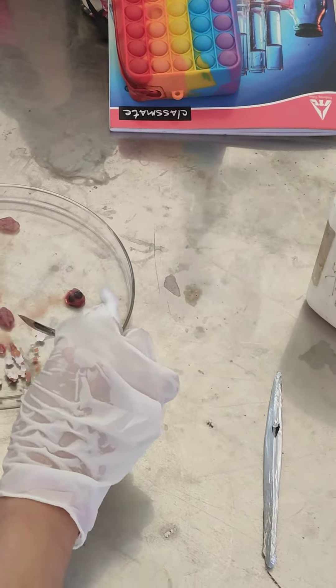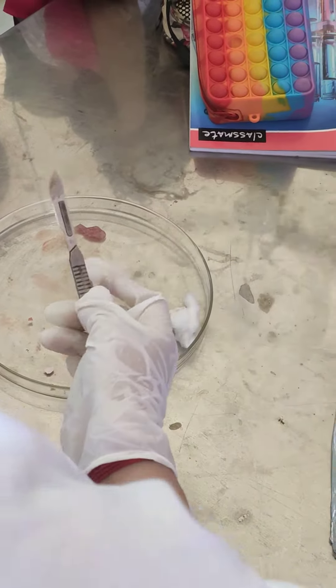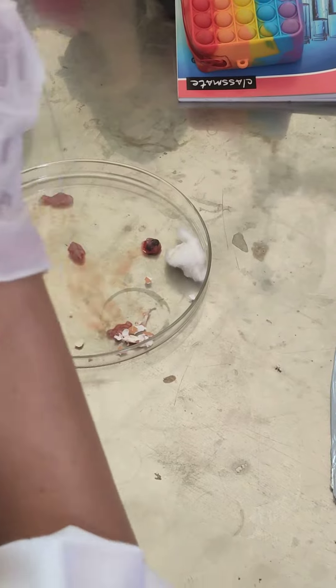And then you can separate the chicken body parts, which you have to separate from everything. Remember, as I told you in class, all body pieces have to be chopped up into small pieces before we give.